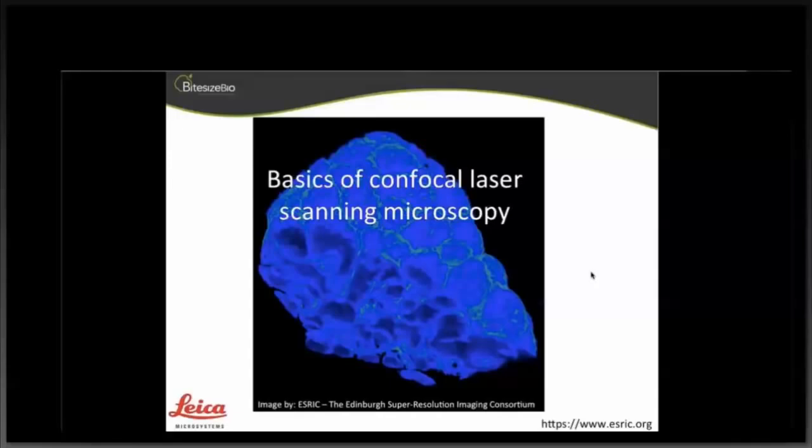Can confocal imaging data be used to quantify structural features such as dendritic spine density, or is the Z-plane resolution too limiting for that? Possibly it could be too limiting, depending on the thickness of a dendritic spine, which I'm not sure about. But since your resolution in Z is about 500 nanometers, a bit more, then possibly. But if you paired confocal with deconvolution, deconvolution can help to increase the resolution and make your images a bit sharper, so it may be able to help in that situation.